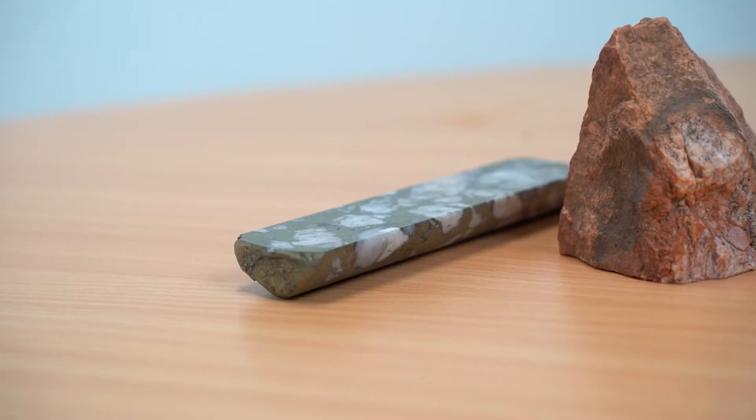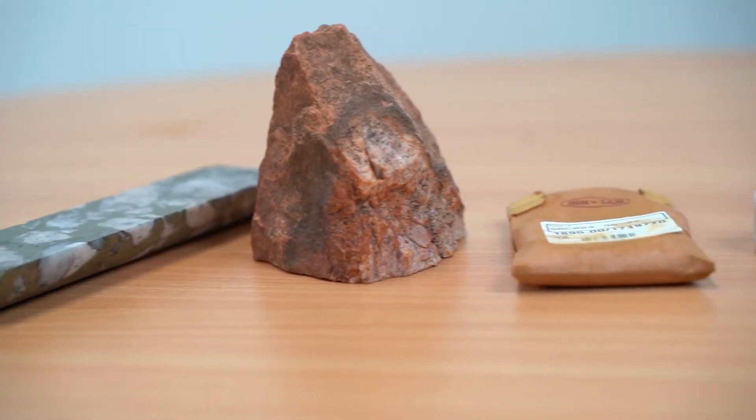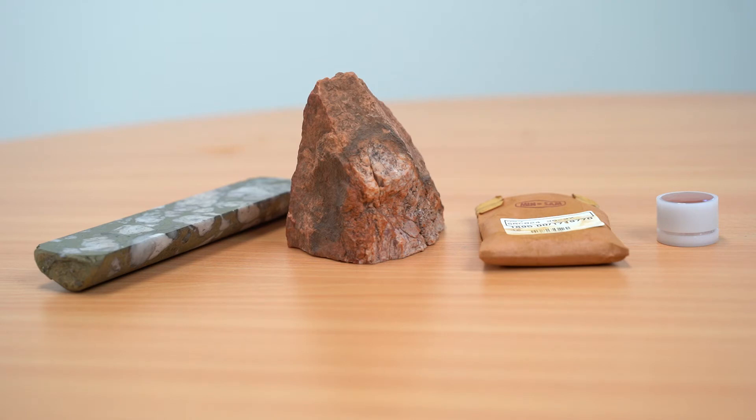The samples we're going to use are a drill core with a flat surface, a hand specimen with a regular surface, a pulverized sample in a sample bag, and a CRM. All these will produce accurate and reliable results.